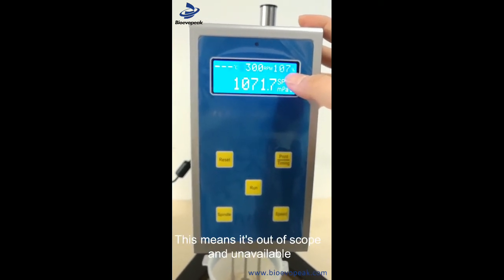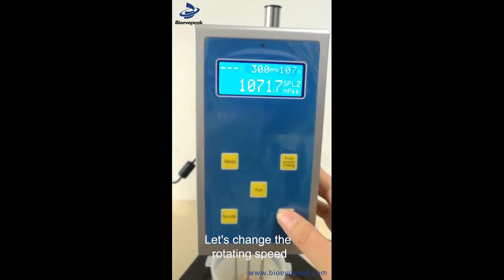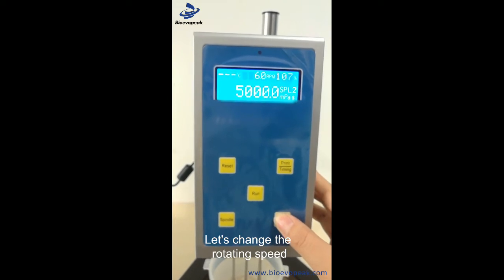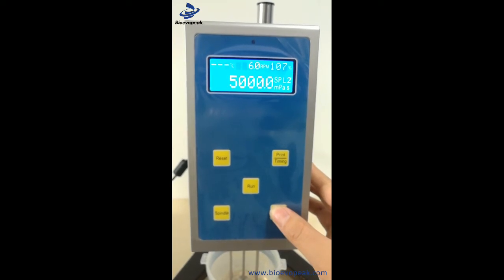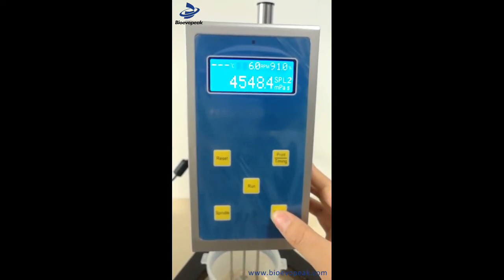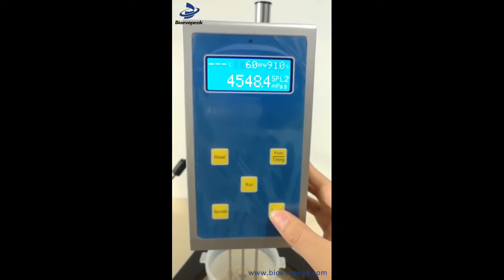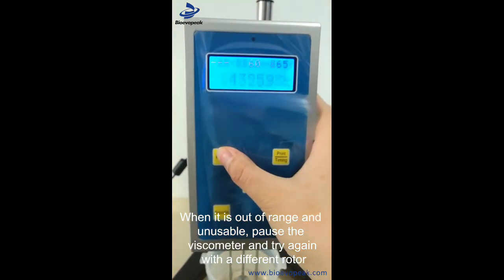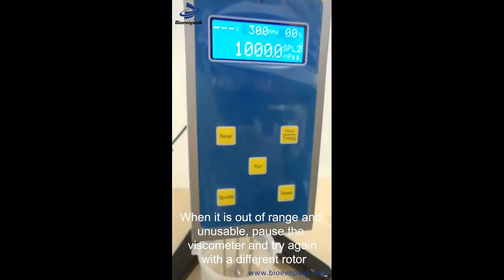Since the reading of 107 is out of the valid range, we need to change the rotor or speed setting. We will stop the current measurement and change the rotor.